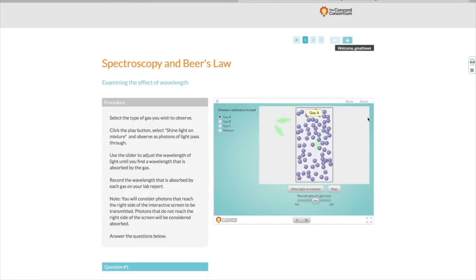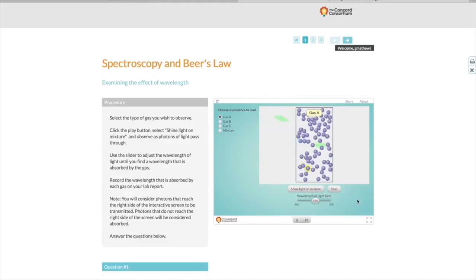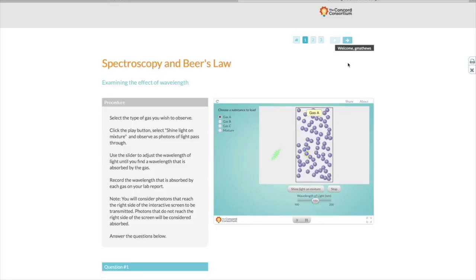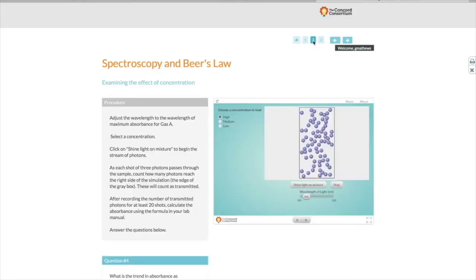When you've finished the experiment on the first page, click on 2 or the right arrow to go to the next page. Notice each of these pages is going to be testing a different variable in Beer's Law. Remember, Beer's Law is absorbance equals epsilon CL. That first page was about epsilon, or the identity of the molecules. The second page is about concentration. The third page is about the path length.